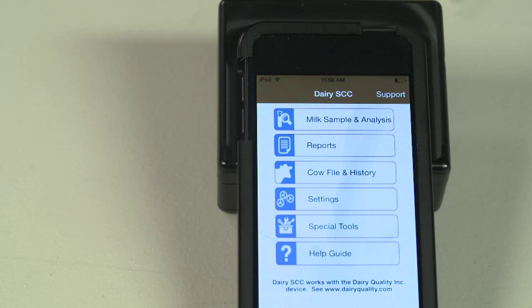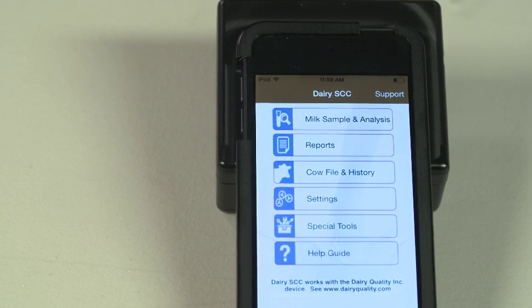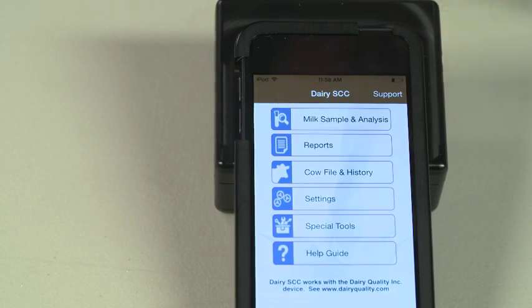Self calibration of the RT10. This function is a fine tuning of the RT10 Classic against a known SCC value. It is not required for RT10 Platinum users. The device is already calibrated to function with a wide range of milk samples. Some users, however, will wish to fine tune the device against known SCC values from other testing equipment.